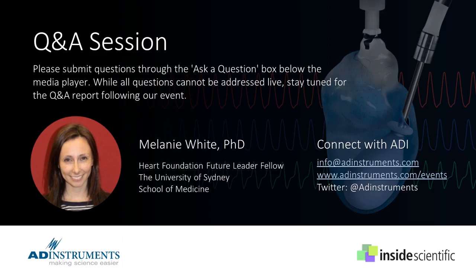Okay, perfect. It sounds like we have quite a few researchers with us who are new to the technique, and we've had a few variations of this question, but Lauren asked, what are the biggest pitfalls for researchers who are new to this application? Do you have any recommendations or details that you wish you knew when you first got started? And what aspect do you find most challenging surrounding Langendorff setup and data acquisition?